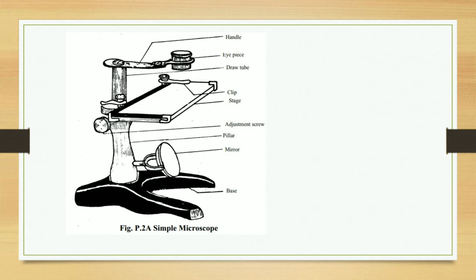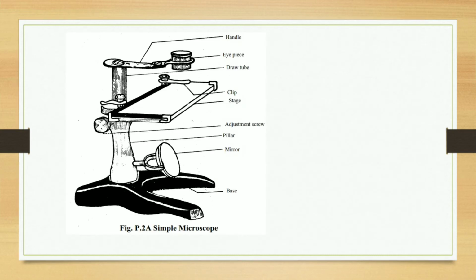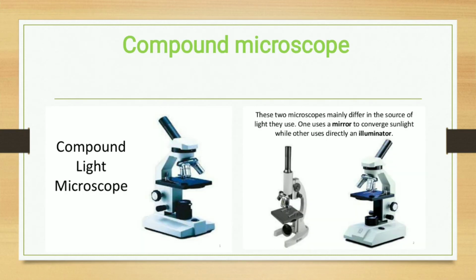Then this is the base for holding the whole microscope. This is all about the simple microscope.